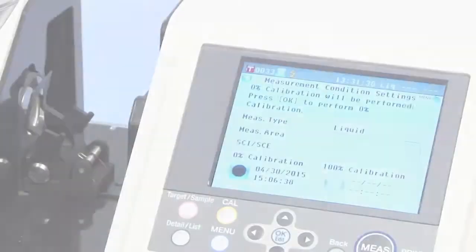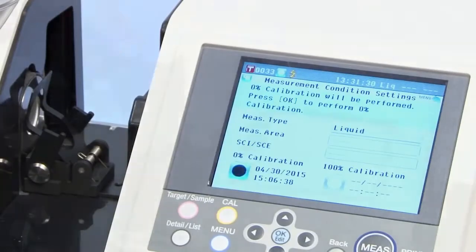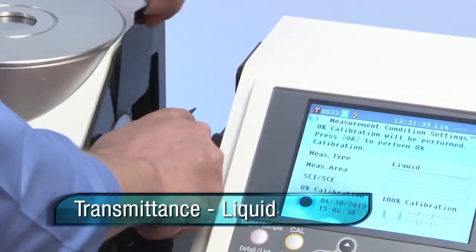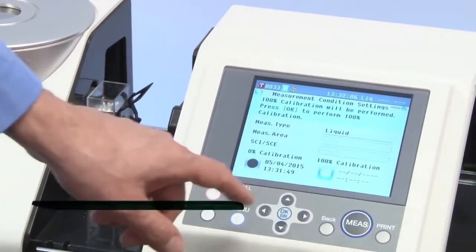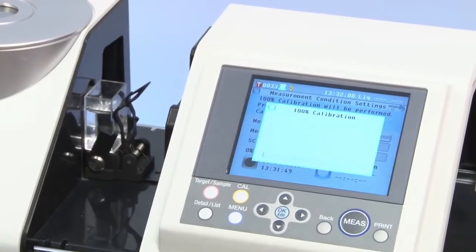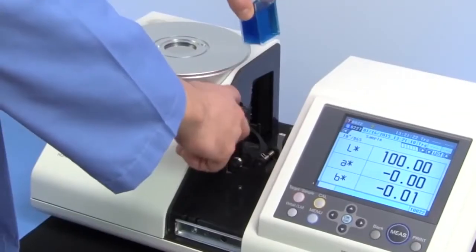The liquid mode will guide you through proper sample preparation which includes zero calibration inside the transmittance chamber as well as a simultaneous white calibration, clear water, and cell holder calibration procedure before measurement.